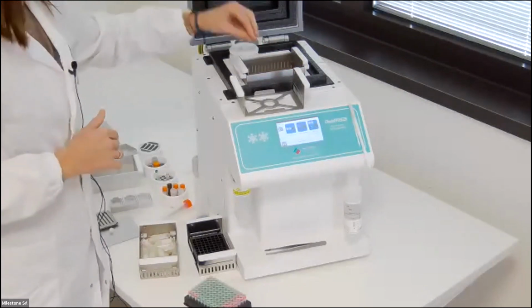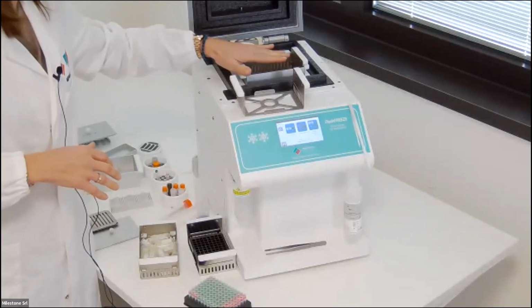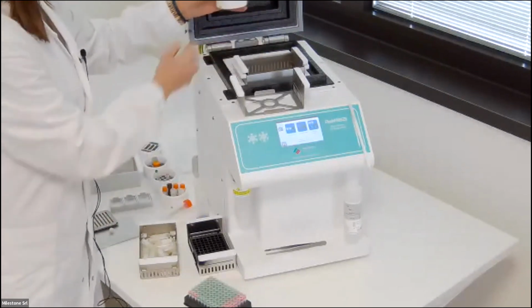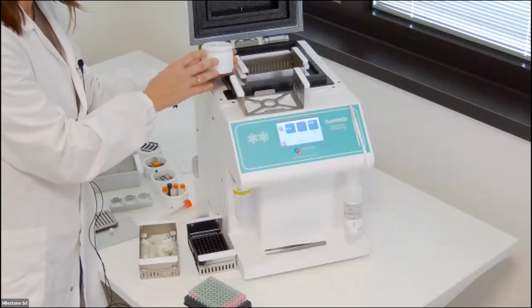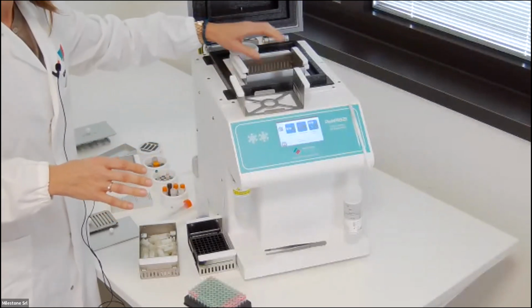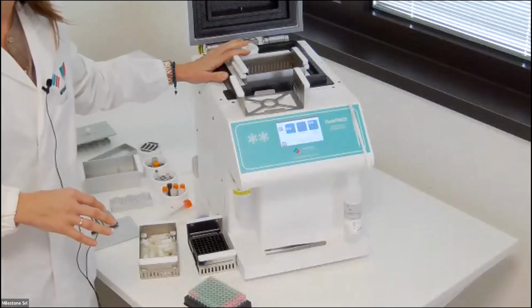And if during the freezing the reagent goes down, you can add some other reagent in order to restore the perfect level. And immediately you can see if it is correct or not. Moreover, in the working area, we have also this container in which we can put some liquid, some ethanol, in order to have it at -80 degrees, so that when we add this liquid, we don't change the general temperature of the freezing container.